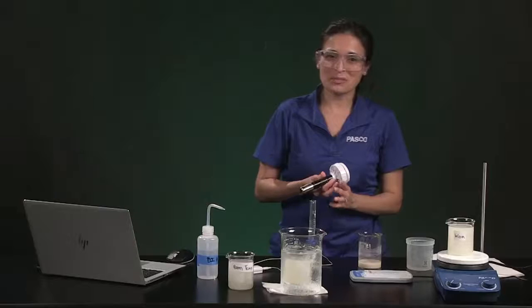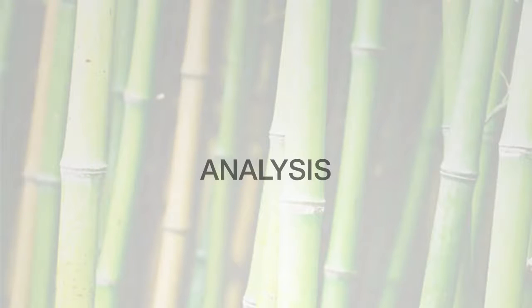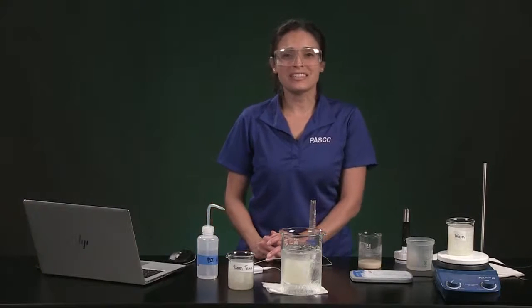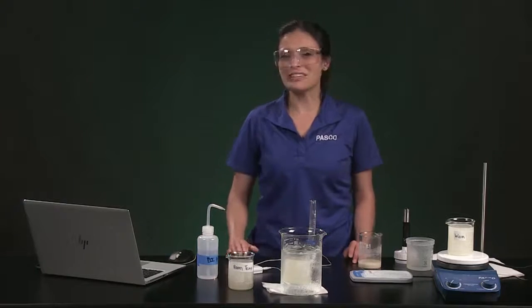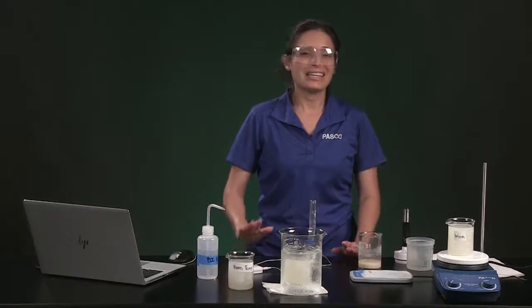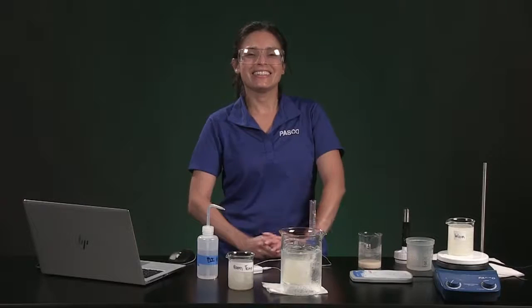Now that all 3 runs are complete, you're ready to complete the analysis. Refer to the end of the procedure for help with calculations needed to complete Table 1. Answer the questions at the end of the lab. While you work, think about this fun fact. I said before that yeasts are found in all biomes on Earth, and that includes the microbiomes inside your body and on your skin. Have fun!